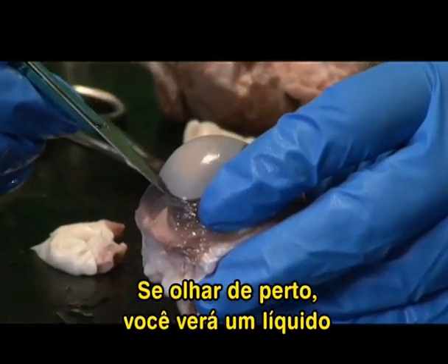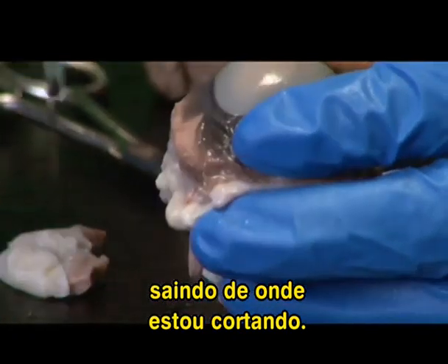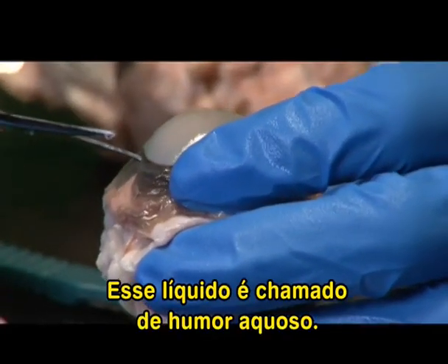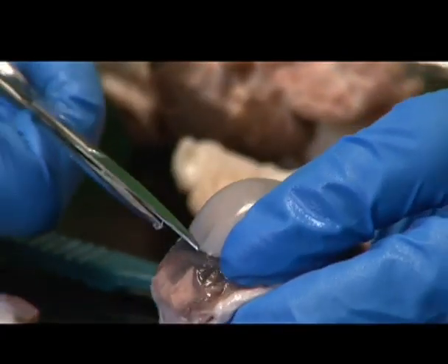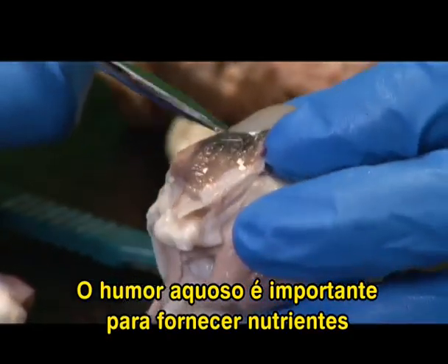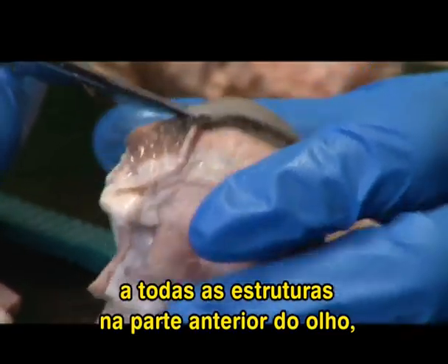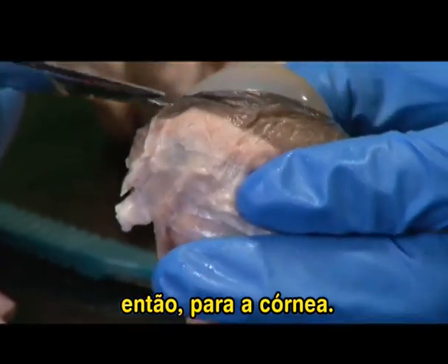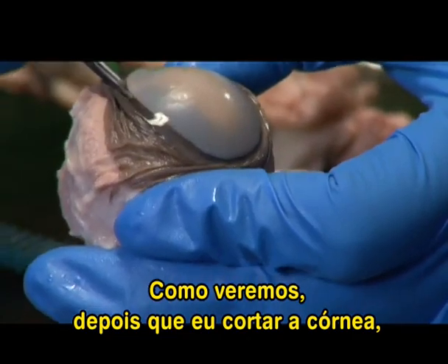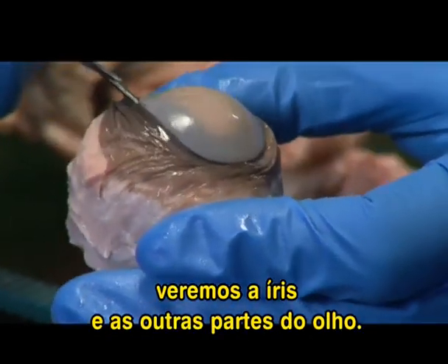If you look closely, you'll start to see some liquid seeping out of where I'm cutting. This liquid is called the aqueous humor. And the aqueous humor is important for providing nutrients to all the structures in the anterior portion of the eye. So for the cornea, and as we'll see, once I cut the cornea out, we'll see the iris and the other portions of the eye.